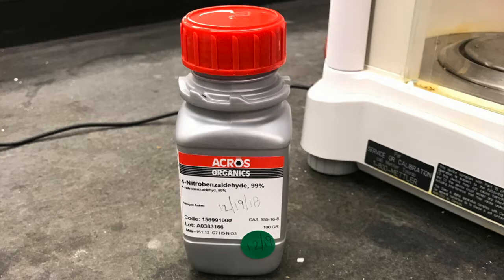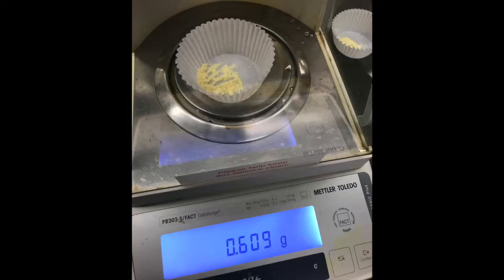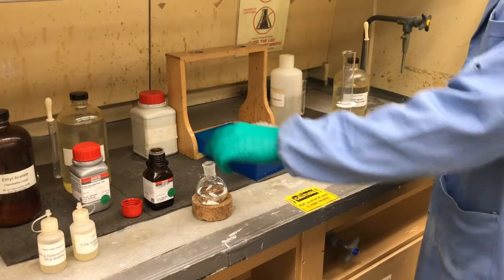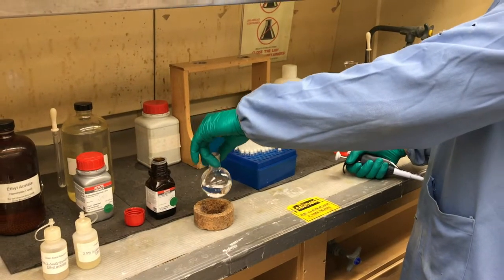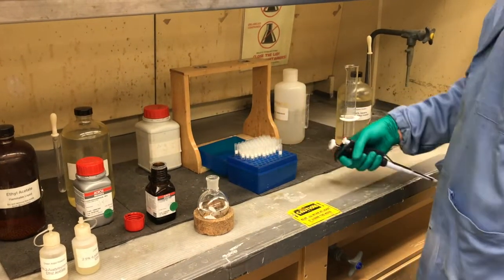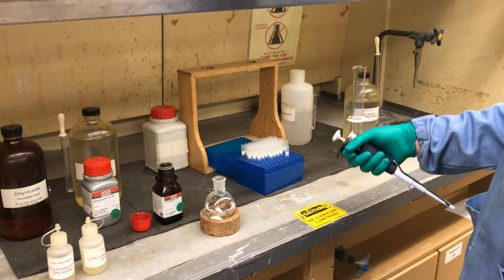So first we start out by weighing the p-nitrobenzaldehyde. We weighed out 0.609 grams. You can see that it's a yellow solid. We've already added the water and the stir bar to the 100 ml round bottom flask. Now we're going to add the 2-acetylpyridine.